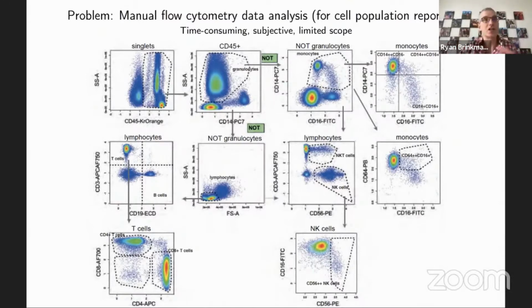There's a lot of variation between two people. There's a couple papers out there that have done some really in-depth analysis, but the numbers in the literature are 20 to 30% variation between experts in the field and the results. And that's kind of sad. And as Tim just said, you just can't analyze everything. There's just not enough time to look through huge data sets. And so that's a problem that we have with manual analysis.